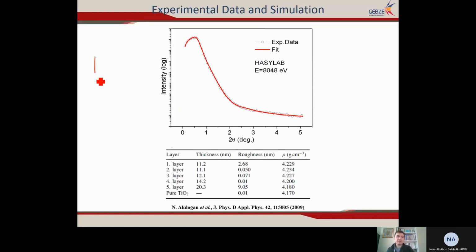This is a titanium dioxide substrate, titanium dioxide rutile. This titanium dioxide crystal has different phases, rutile, anatase, and also brookite, as much as I remember. Then you implant this titanium dioxide with cobalt plus ions, okay?